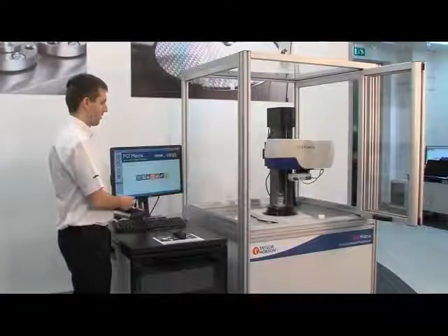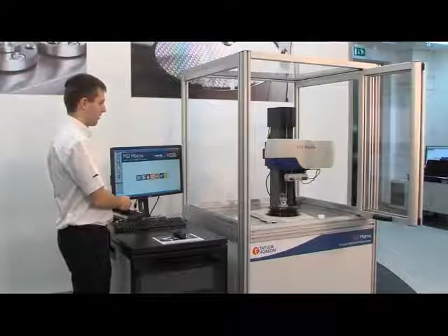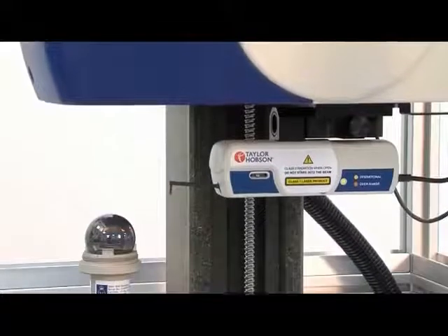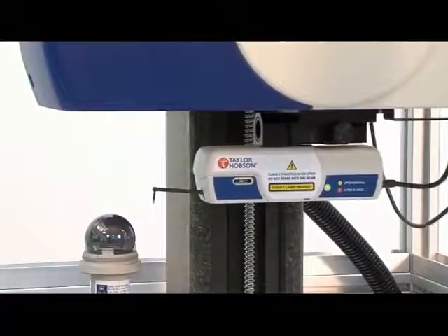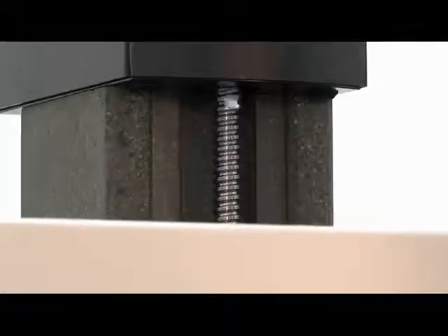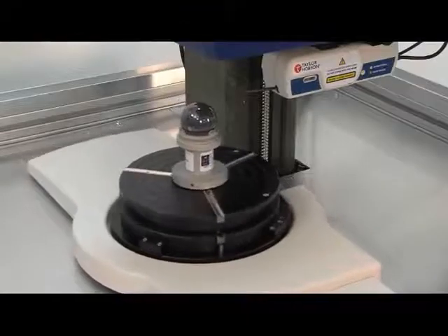The PGI Matrix from Taylor Hobson is a fully automated system for precision optics measurement. It's easy to program, easy to use and extremely accurate. It's packed with powerful analysis tools to improve your capacity and capability.